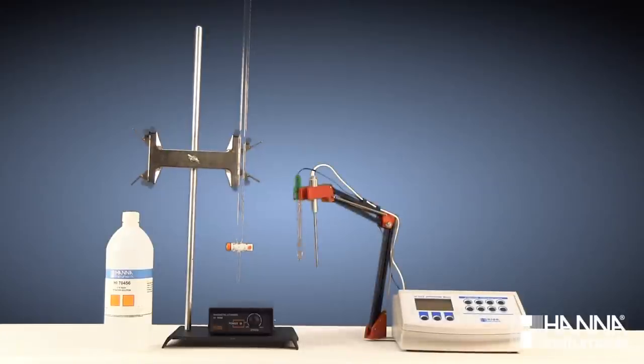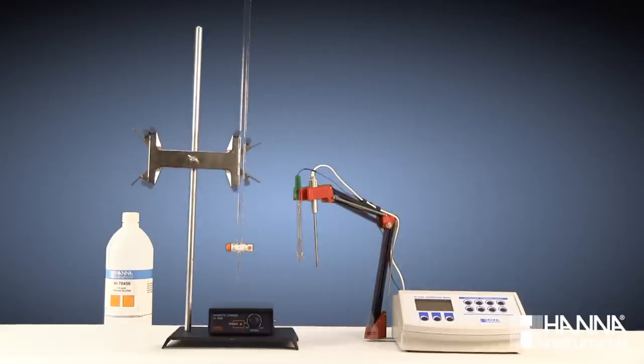A pH meter, such as our HI3222 research grade meter, a pH electrode, such as our HI1131B, an automatic temperature compensation probe, and a color indicator. Today, we'll be using phenolphthalein, which changes from colorless to pale pink at a pH of approximately 8.2.